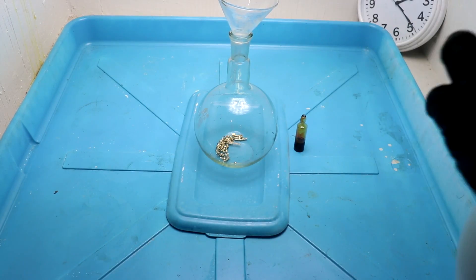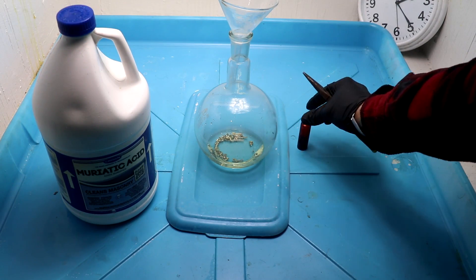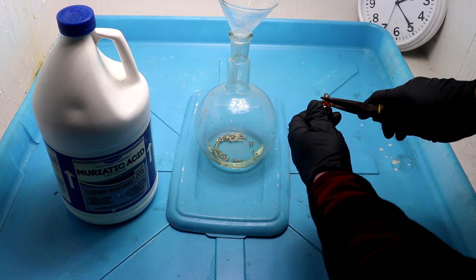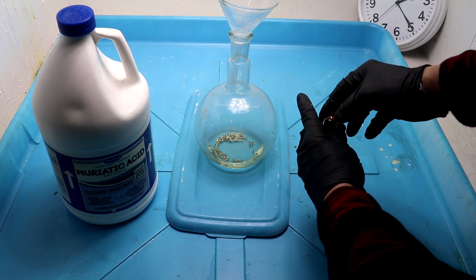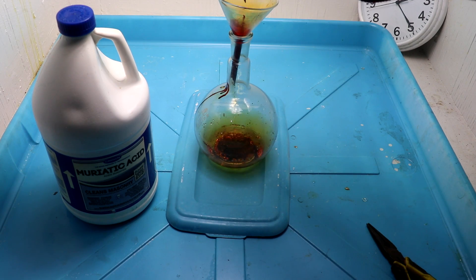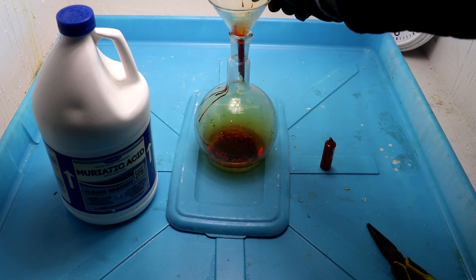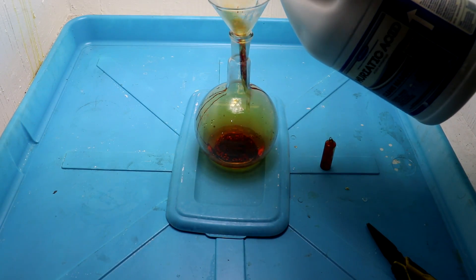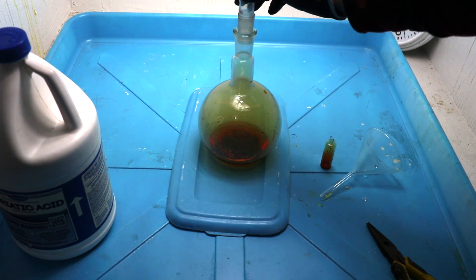The first step to purifying the gold is to dissolve it. For that I'm going to use a mixture of hydrochloric acid, and for the oxidizer, elemental bromine. I'll just break the top off of this ampule here — there we go. That will oxidize the gold so the hydrochloric acid can dissolve it. I'll wash that down with a bit more acid, and now seal it up with a glass stopper.